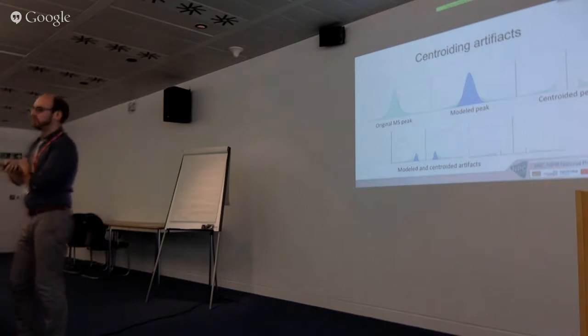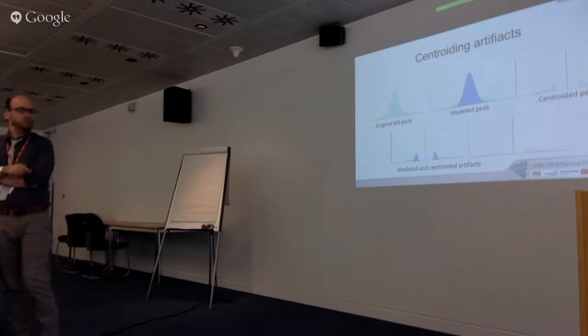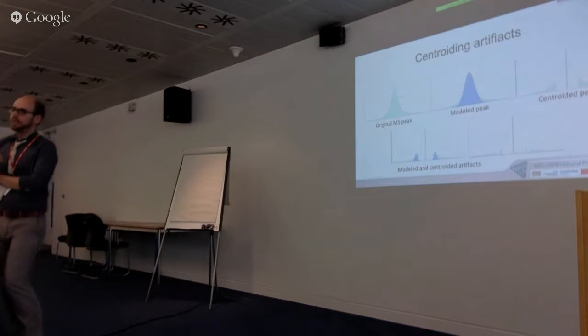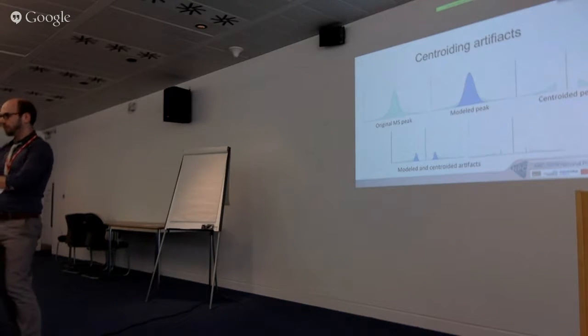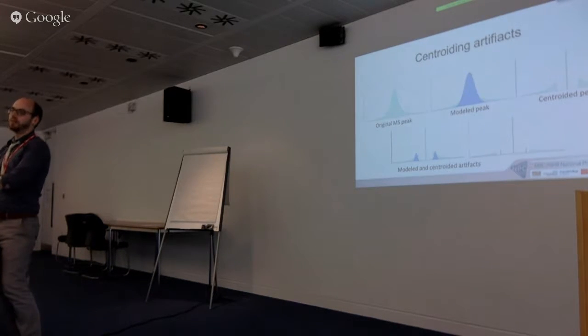So first question is, why are you dealing with continuum data? Because the first thing we can obviously do is go straight down to centroiding when it comes to data reduction. And unfortunately, we find that there are significant quality problems with just going straight to centroided data. One of the prime ones for us is we deal with spectrometers, all TOFs, and we like to tune our TOFs for sensitivity, because when you're running very long assays, sensitivity is something we can trade off against the length of the run.